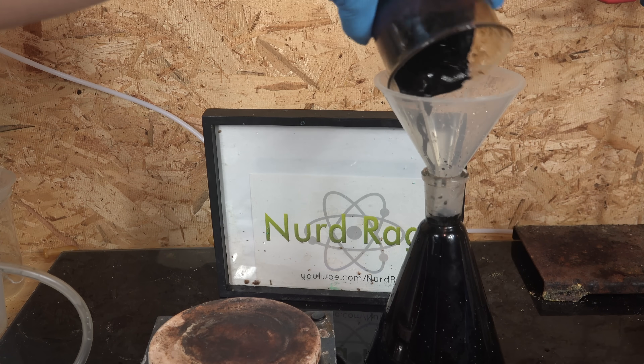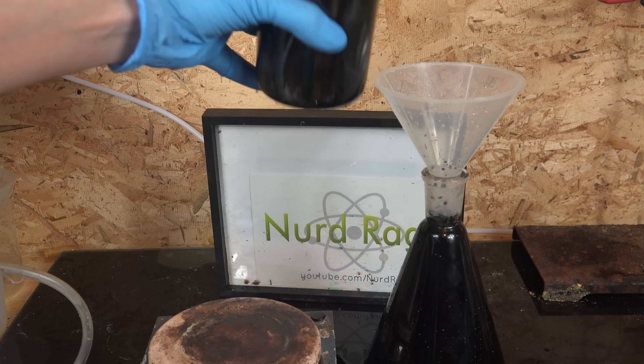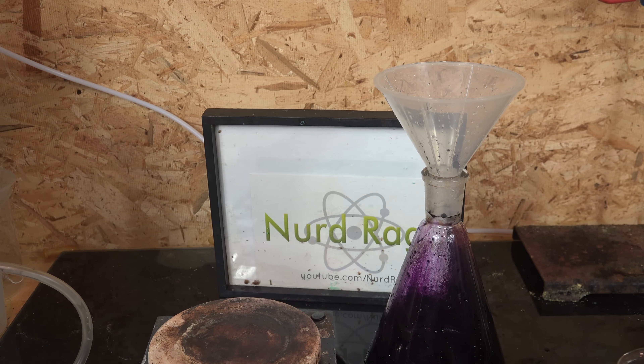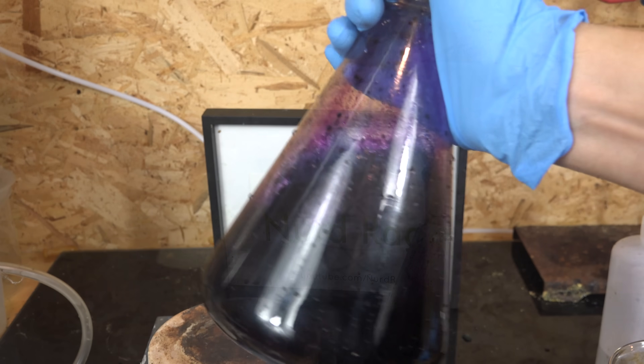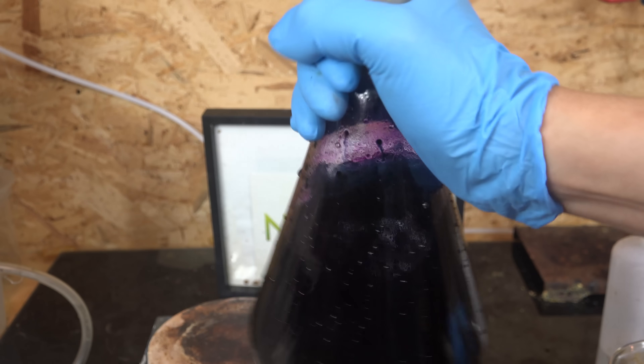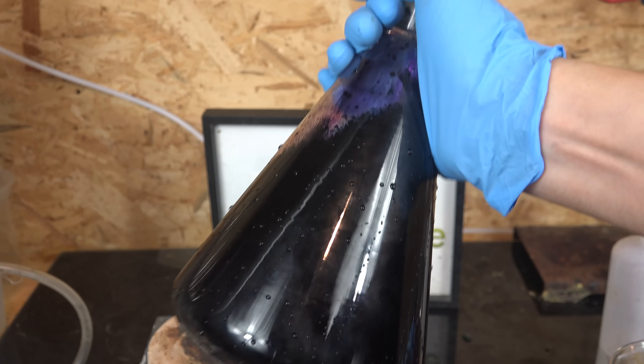We transfer it to a larger flask, using a little water to wash it over. You can already see it turning purple as the water dilutes the potassium manganate enough that it disproportionates into manganese dioxide and potassium permanganate. The amount is very small but the color is very strong — but we want something higher yielding.